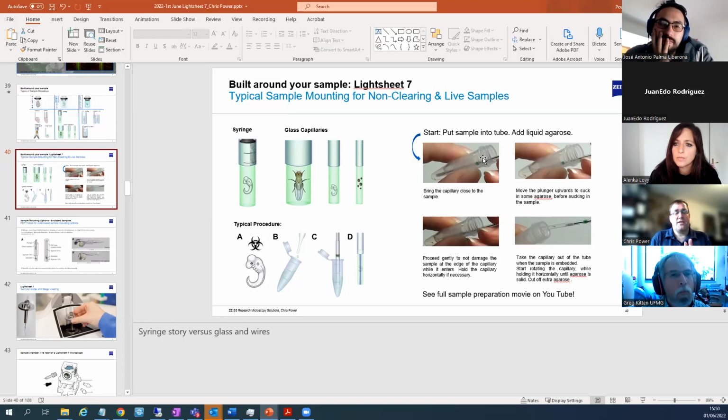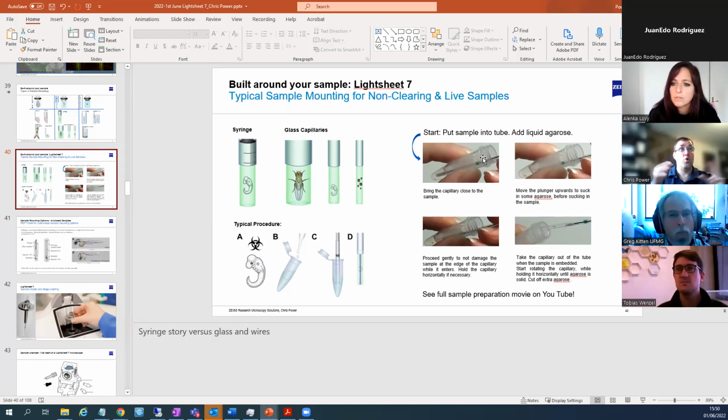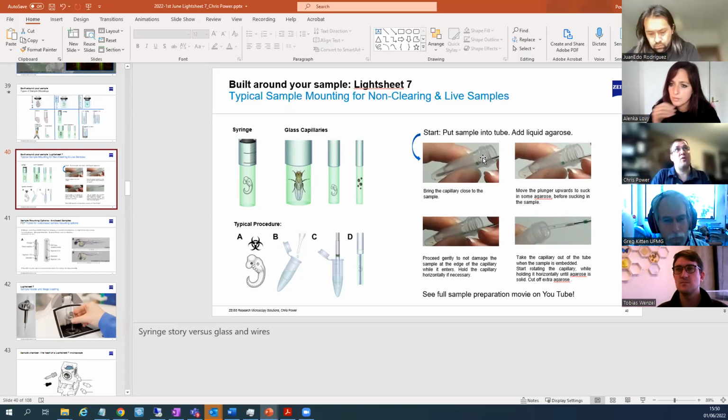Lightsheet won't make that necessarily easier. So one big question is kind of what goes deeper. In the early prototype days, we built a system that had a Lightsheet, a confocal, and a multiphoton on it. And we did a lot of work looking at spheroids. Now, these are 600 micron spheroids. We got about 100, 150 microns with confocal. We got about 250 microns with the Lightsheet, and we got about 350, 400 microns with the multiphoton. I say we got about that.